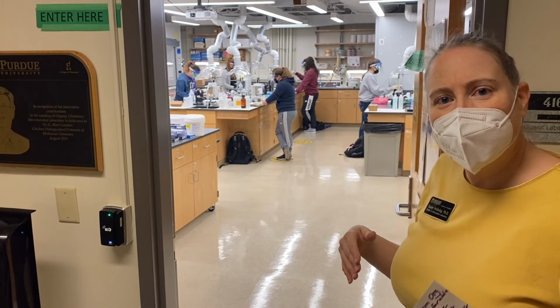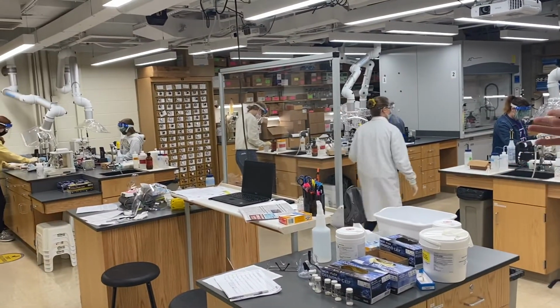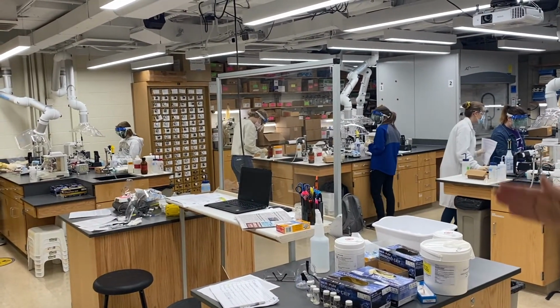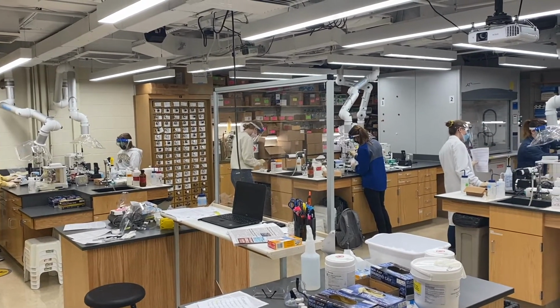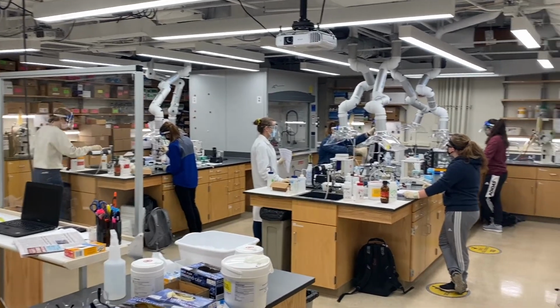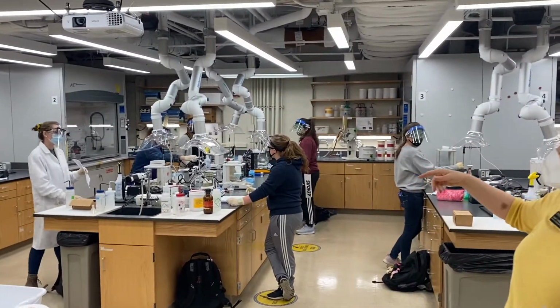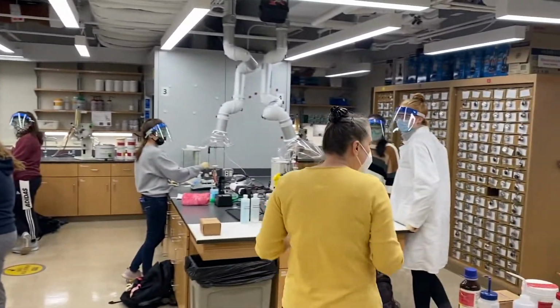All right, so let's go ahead and look at some of the features of the lab. You'll see that we have some protection here, plastic shields, so the TAs teaching can be heard by the students. We also have a microphone amplification system so that they can be heard. We have a graduate TA, and there's Katrina. And we have our undergraduate TA, Sarah.